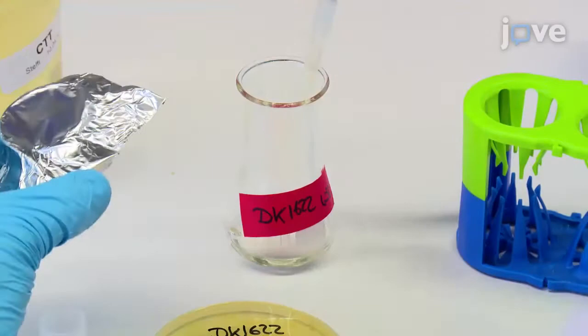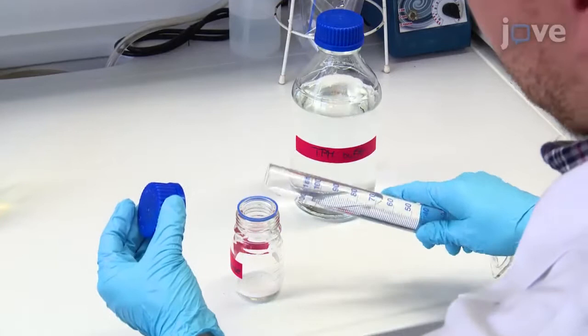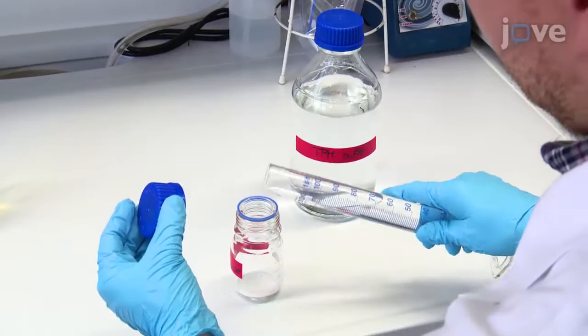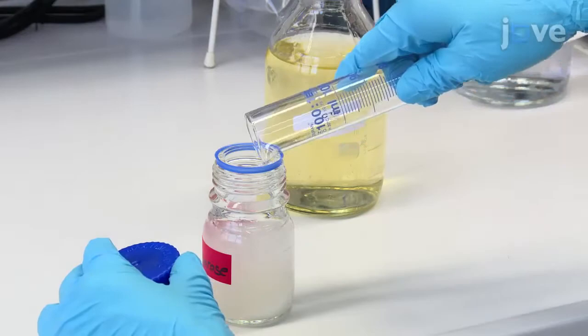Prepare 1% agarose microscopy solution containing 0.2% CTT by mixing 1 g of agarose with 80 mL of TPM buffer and 20 mL of 1% CTT medium.